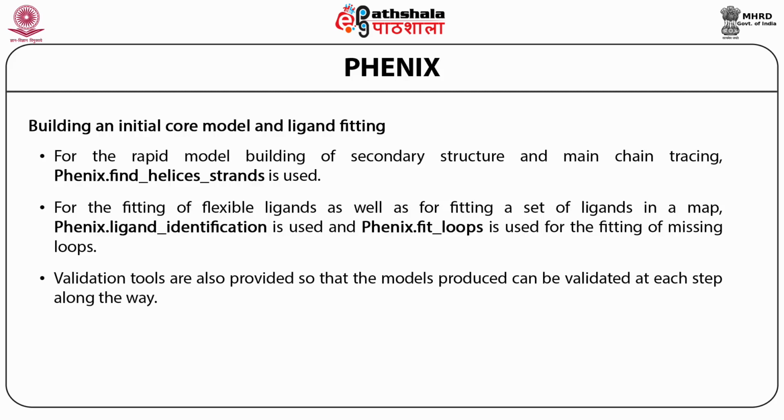Validation tools are also provided so that the models produced can be validated at each step along the way. Numerous research publications have been made by Professor Tom Terwilliger and also by Paul Adams, the two principal authors of this suite called PHENIX. So we have Resolve, which does the model building. This is a part of the PHENIX suite.